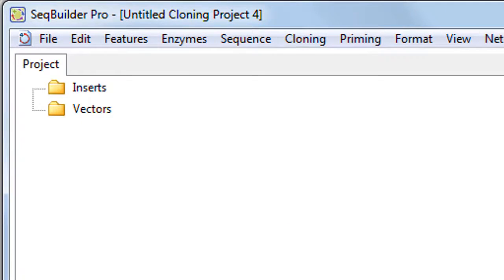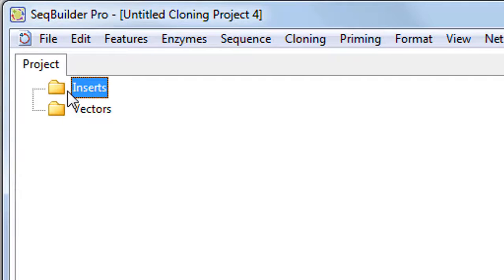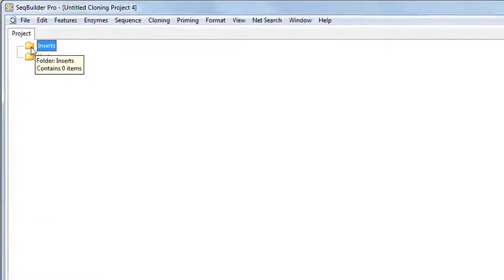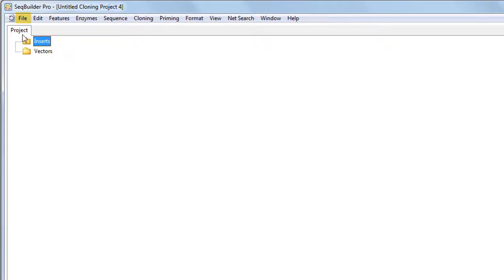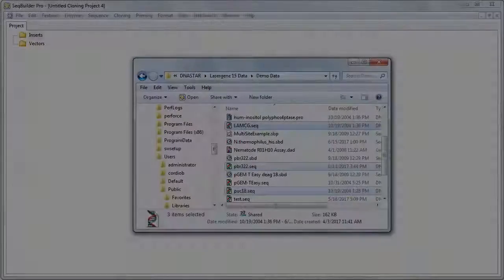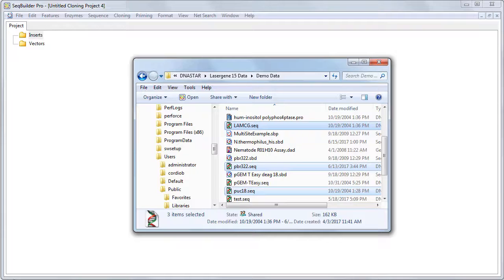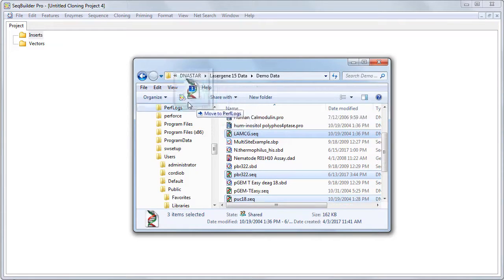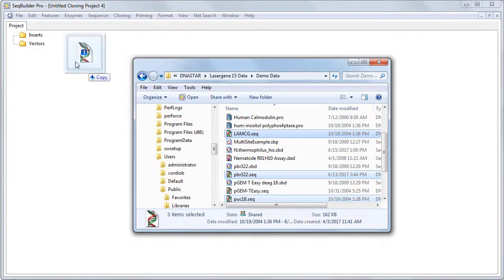In the cloning project window, select the Inserts folder, then select your insert sequences by going to File Import Sequences to Project. Alternatively, you can drag and drop the desired sequences into the Inserts folder from your File Explorer.